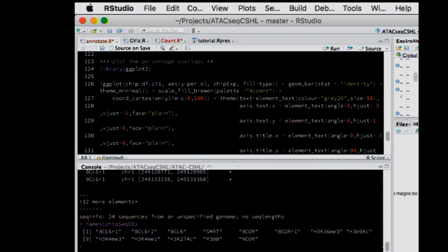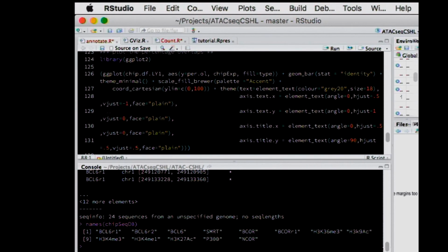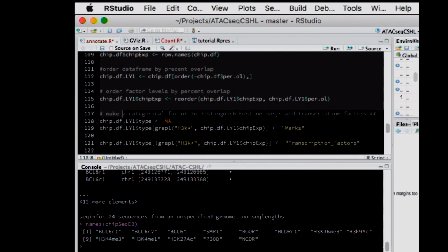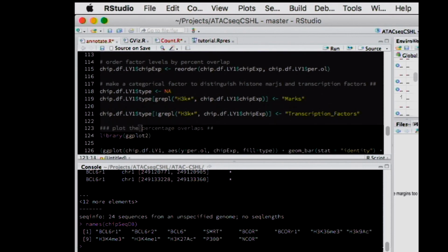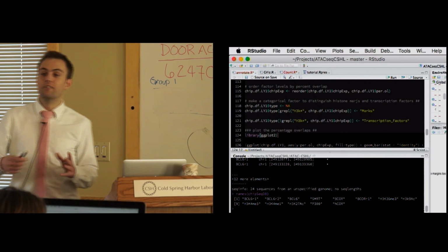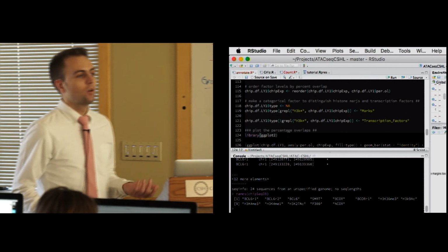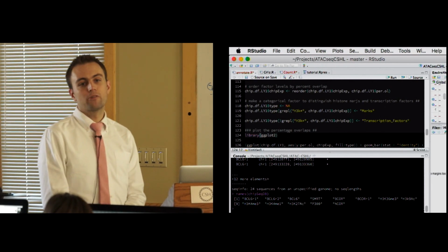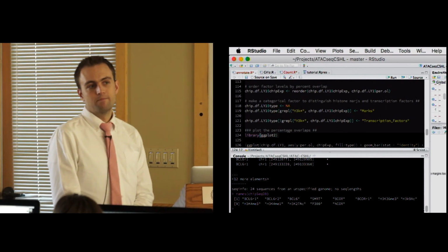Let's maybe go down. There's a lot of code in here just to make a data frame structure of this. That's a typical data structure in R that you can plug in to plot and to relate variables in a way that you'd typically analyze them.